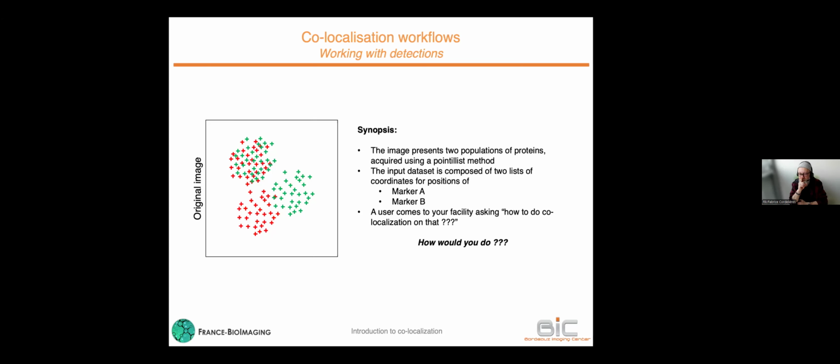But before that, look, I've got detection. So tiny little spots. Correlation is something that you would apply if you've got plain objects, and then you would try to correlate the signals from the two channels. So having tiny spots like that, it might be tricky to have correlation. So maybe we need a step before that. Why would you say that it's trickier to have correlation with tiny spots?